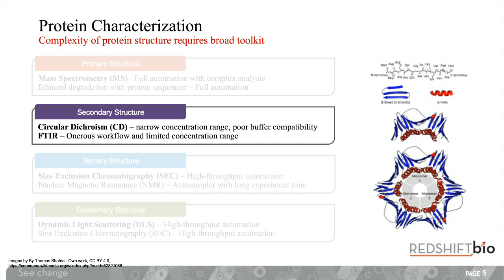Unfortunately, with Fourier transform infrared spectroscopy, until now, this has been extremely limited, particularly in terms of concentration. So in order to get a reasonable signal for a benchtop system, you need approximately 10 milligrams per mil of your sample, and you need to be very careful with the background subtraction.